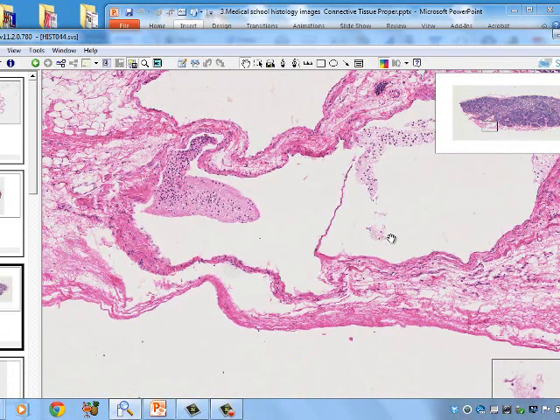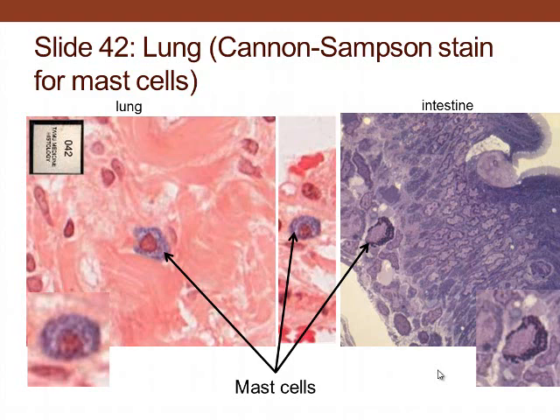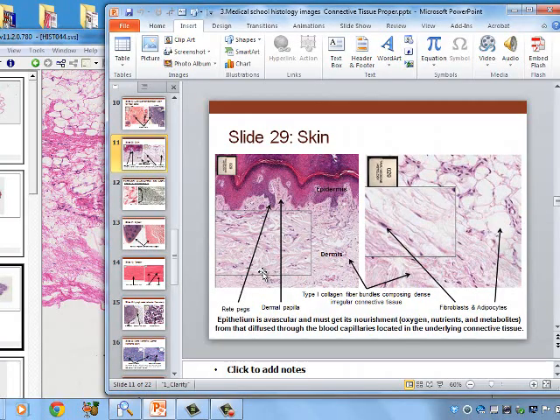Slide 42 shows lung tissue and intestine. We see a mast cell with a euchromatic, lightly staining, large nucleus — not lobulated like an eosinophil. A special stain reveals the granules, which contain histamine and heparin and are associated with itching and allergic responses.